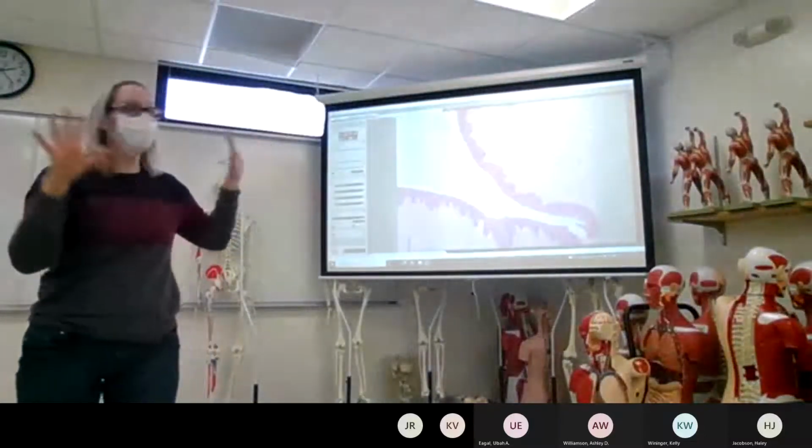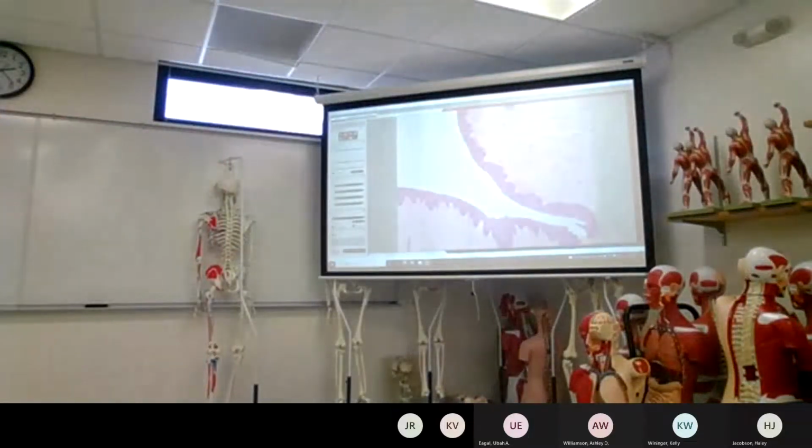Are we finding this? The next one should be transitional epithelium, if you have a group that's pulled that up.